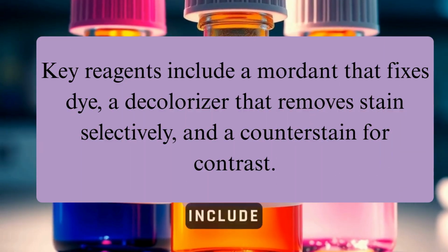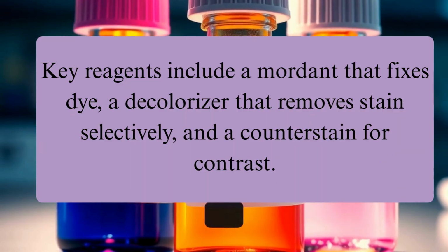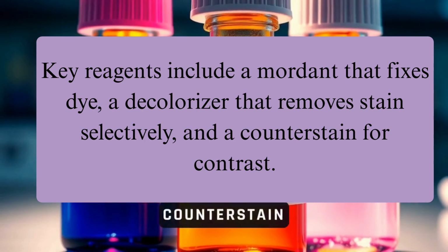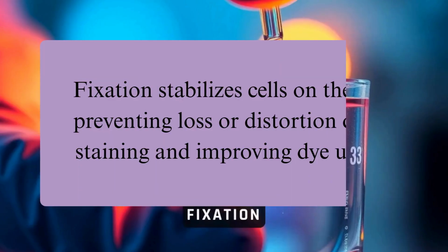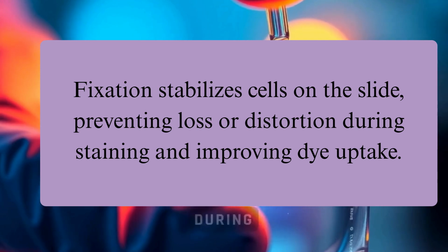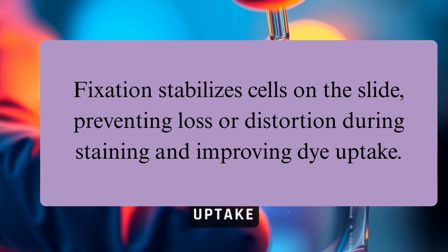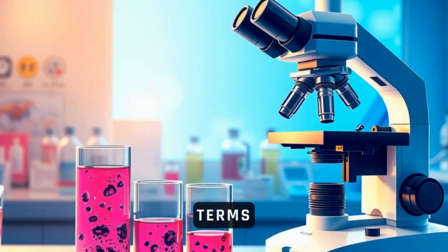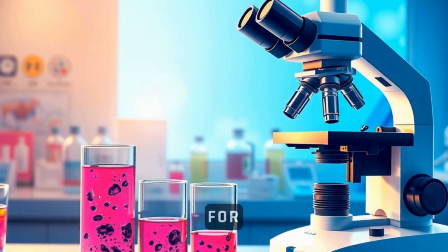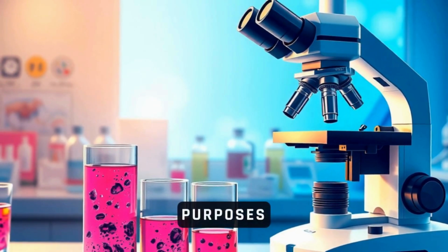Key reagents include a mordant that fixes dye, a decolorizer that removes stain selectively, and a counterstain for contrast. Fixation stabilizes cells on the slide, preventing loss or distortion during staining and improving dye uptake. Understanding these terms helps interpret results correctly and choose the right protocol for diagnostic or research purposes.